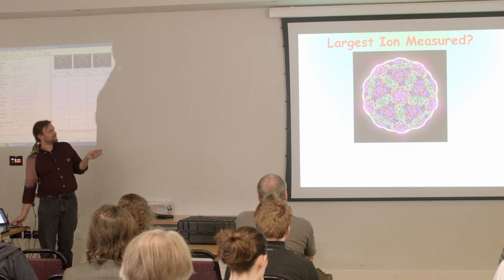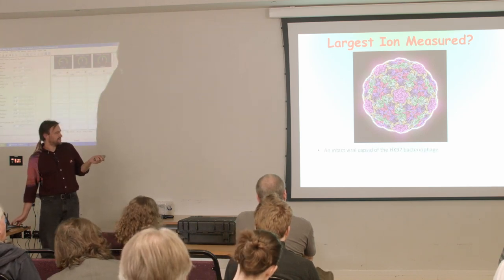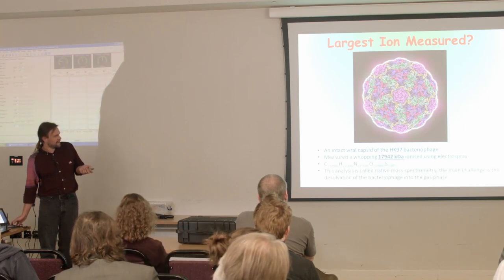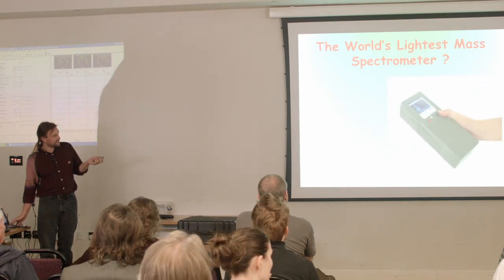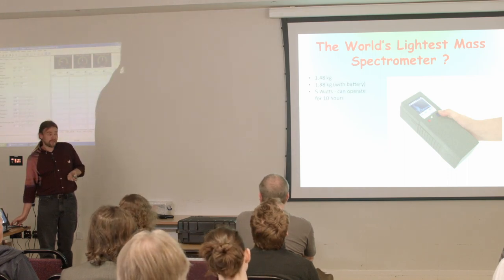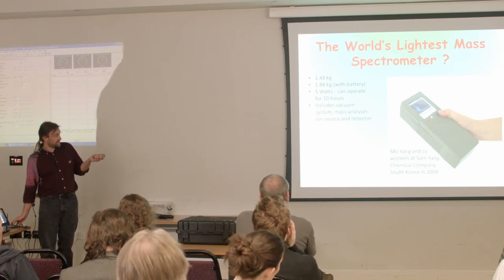Largest ion measured. This is a bit biology, but biologists do use mass spectrometers. This is a viral virus, 17,900 kilodaltons. World's lightest: this is a handheld device, 1.8 kilograms with a battery, pretty good. It only consumes 5 watts of power, and that includes the vacuum system and everything.